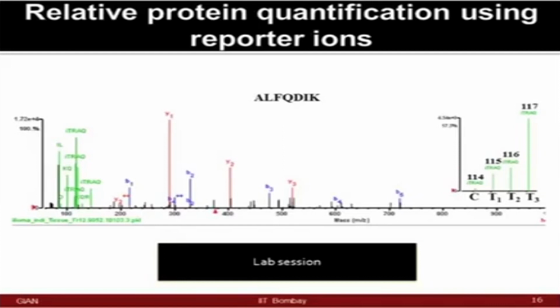At the end of doing the entire work, you will derive these kinds of sequences, and for each one of these peptide sequences you will look at the reporter ions for MS/MS, which will help you do the quantification. So, this is the way of doing data presentation for this kind of iTRAQ workflow. Not every single data point can you show in your papers and reports, but at least certain peptides you need to show, so that your quantification looks accurate and your claims about up or down regulation actually make sense from various peptides.